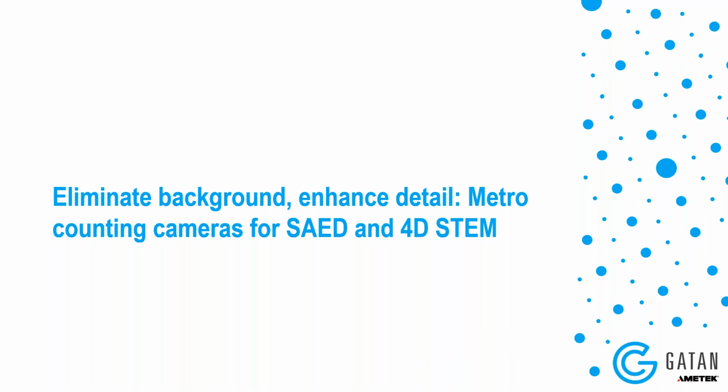Most of the data that I'll show today, I collected myself with the Metro camera and the Metro 300 camera. A few of the data sets were collected by other researchers.